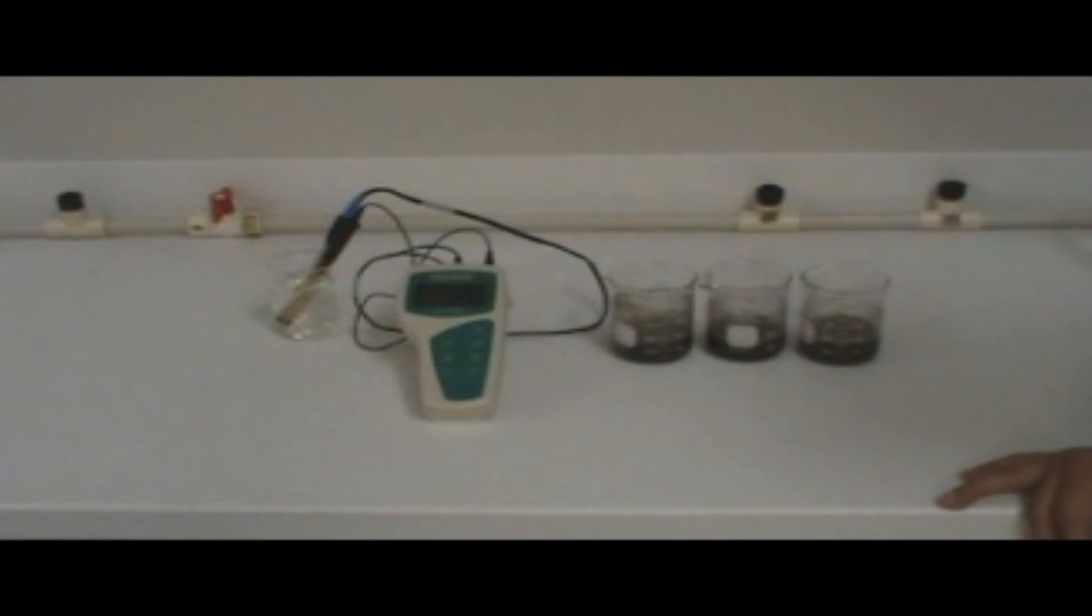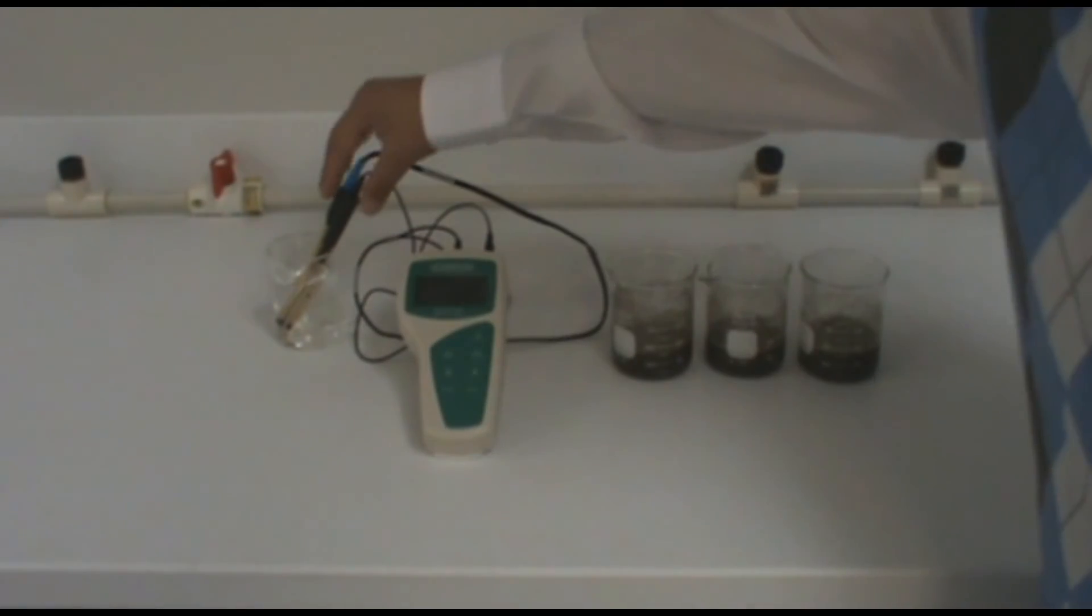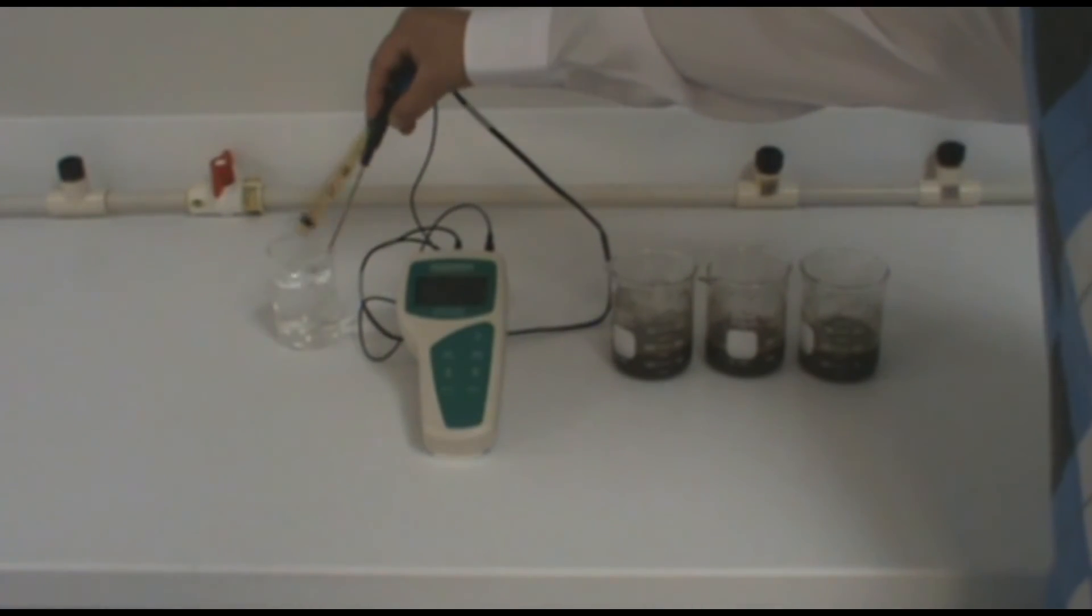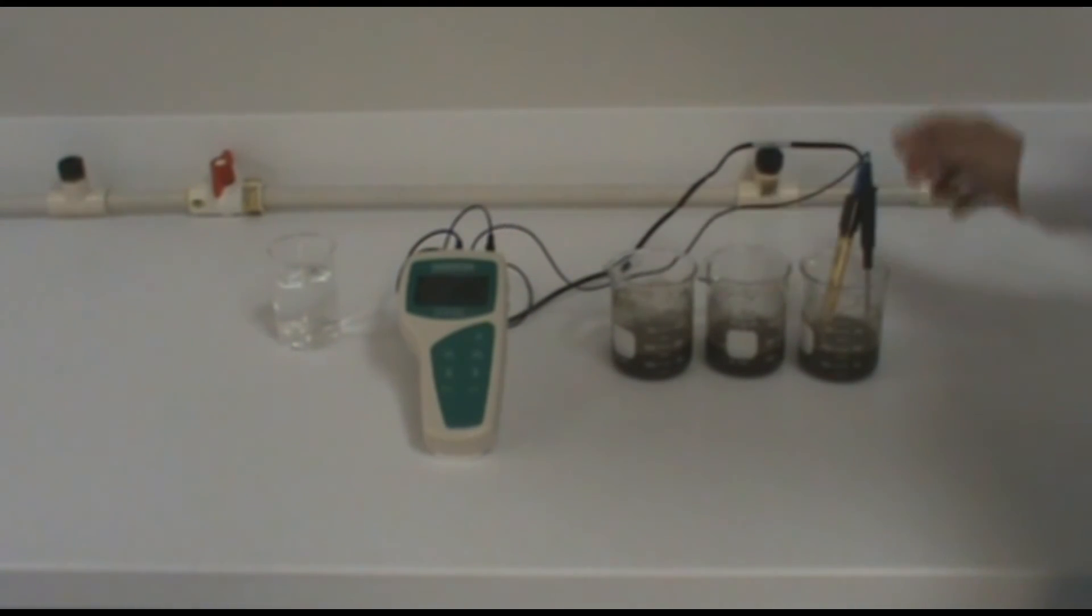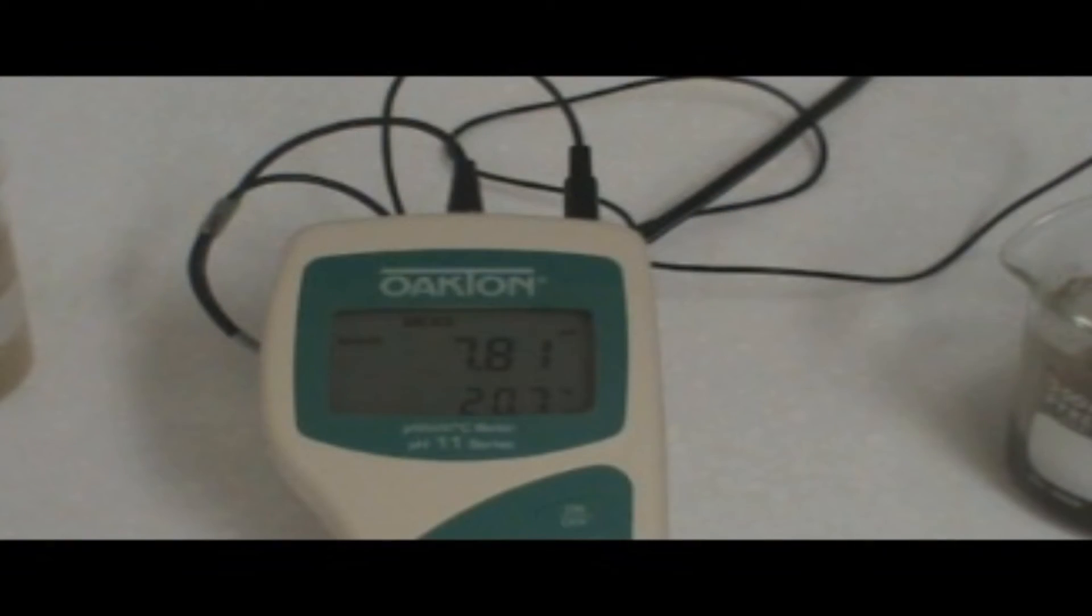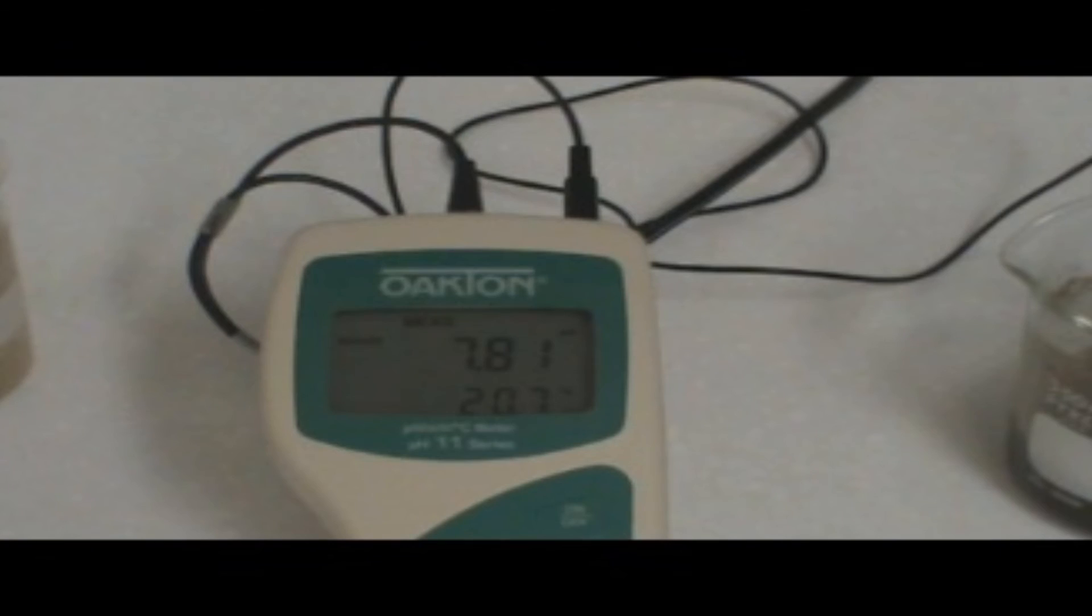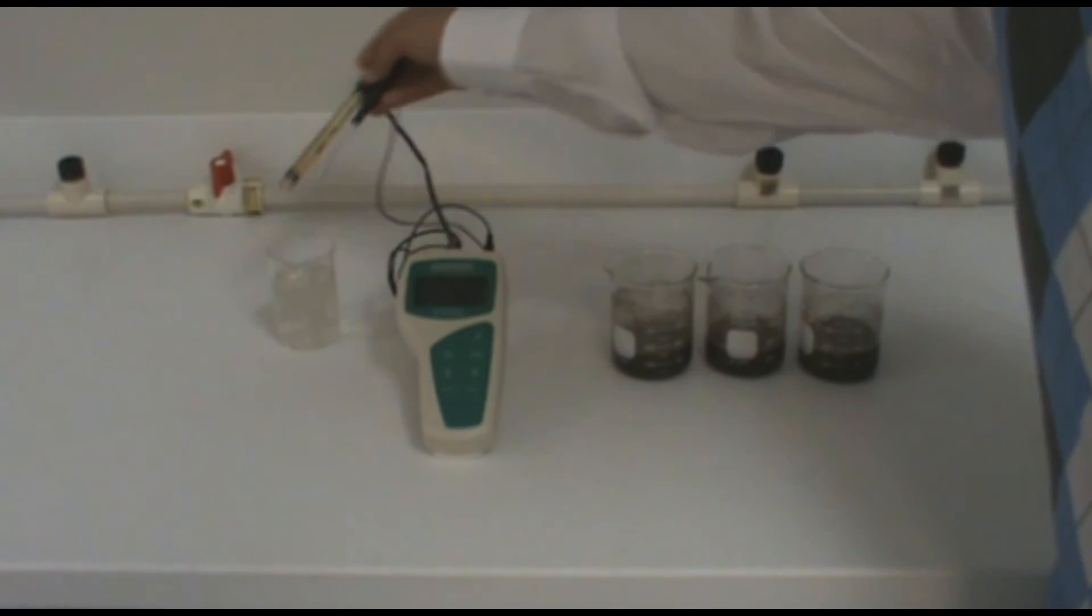For time purposes, the pH meter and electrode being used have already been calibrated. Take the pH electrode and ATC probe and place them in the first soil sample. Allow the reading to stabilize and record this reading. You will then follow the same procedure for your next two samples.